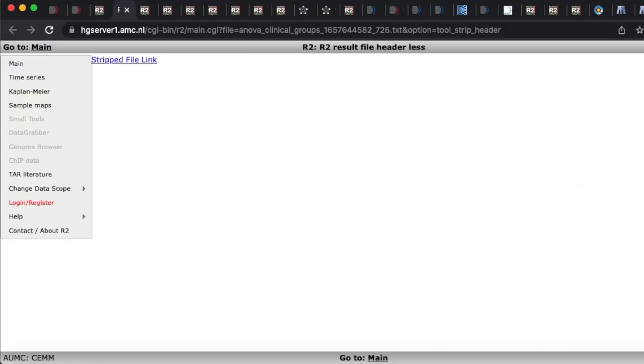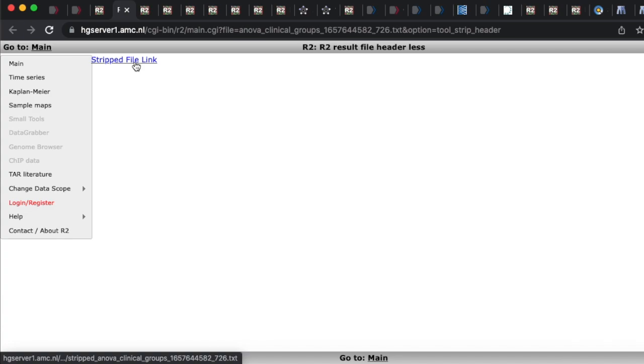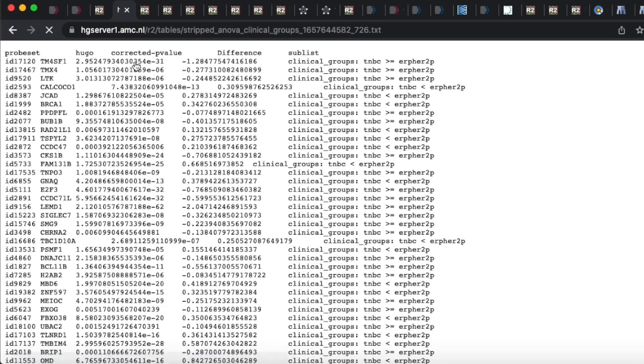This is how easy it is to get their data. You'll come to this and you'll go to a blank screen, you'll be like what the heck happened. Go to this strip file link and click on that. We now have millions of dollars of research results for free.